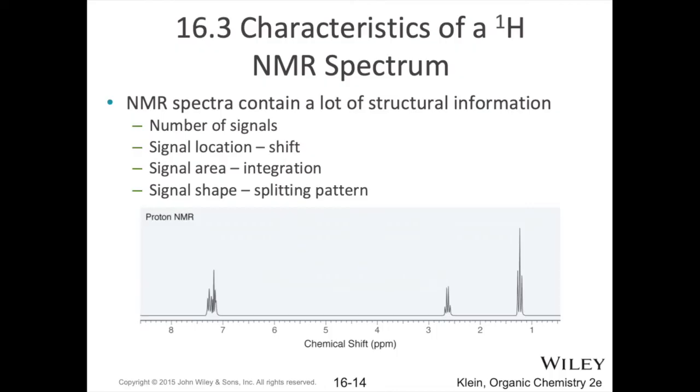We're also going to look at the area of these peaks, what's known as the integration. The program that gives you the NMR data will allow you to click and ask what the area of the graph is in a given region, and that gives you useful information about the protons giving that signal.